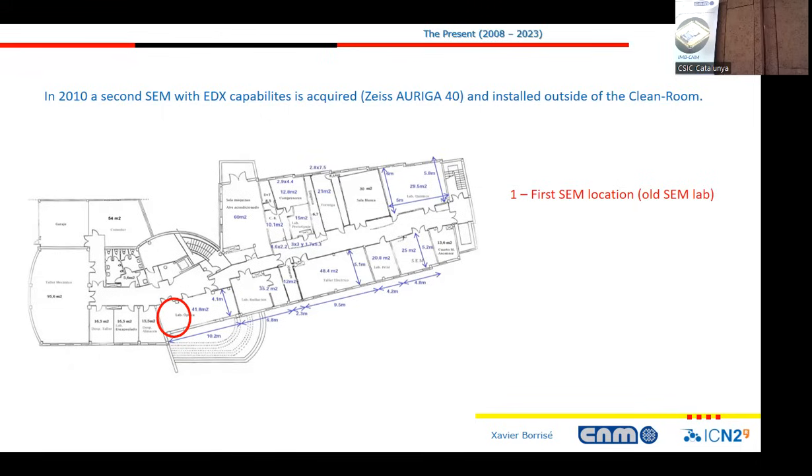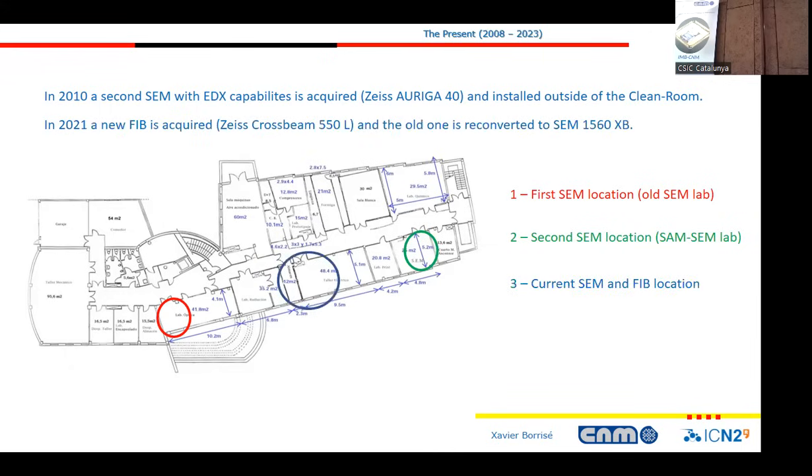First we were here, and now it's the optical group laboratory. Then we moved here, where the SEM laboratory is now. Well, now it's SEM only. And finally, after the remodelation of the basement, now we're here with the new FIB that we bought in 2021, which is from this Minatech project that ended last year, okay? And we will review that.